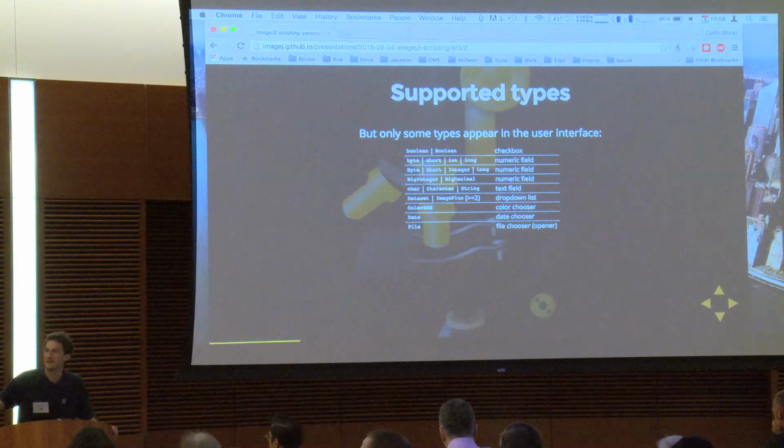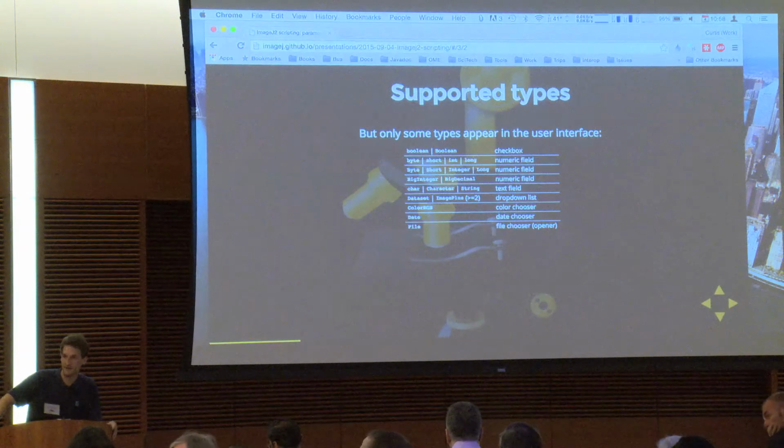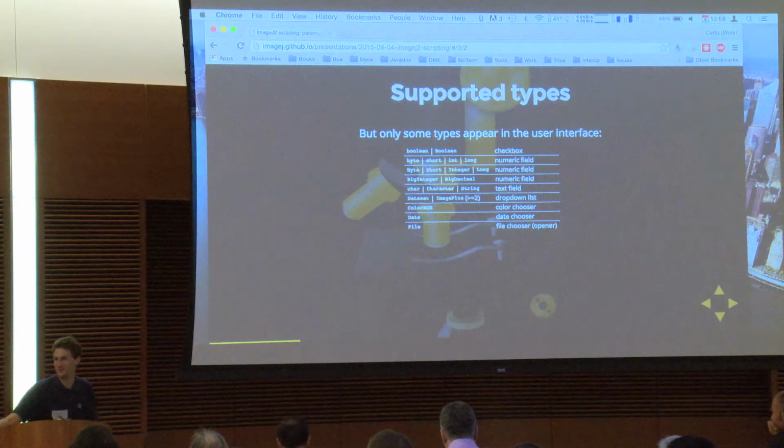If you put things in, then you cut something out, and it tells you that it needs it. It doesn't remember all the other things. That seems like a bug. Yeah, I don't know. No, I'd call that a bug. That's a good point. You could file an issue if you want to report a bug. No, I want to fix that.